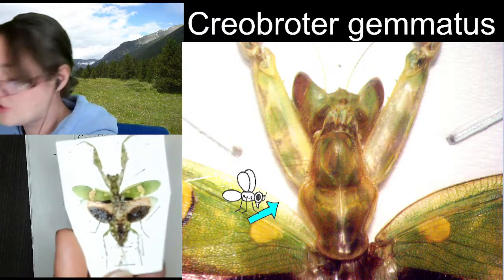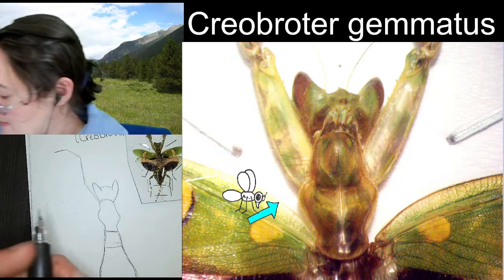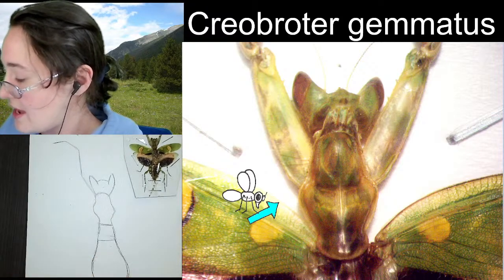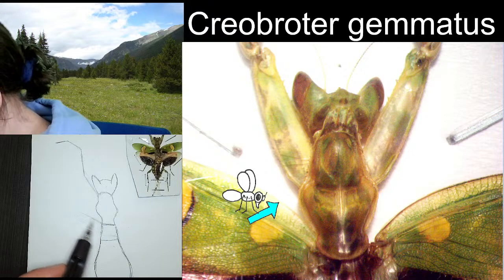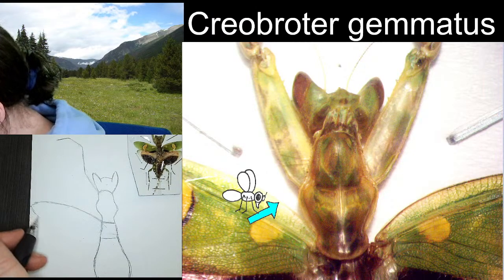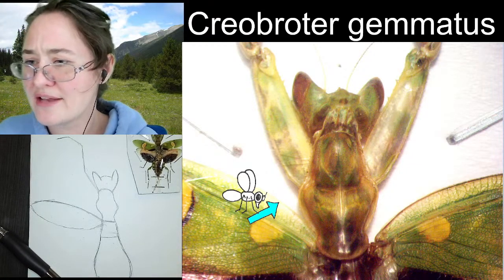So, let's see. I'm going to say this front wing here is about the length of the abdomen. And when I find the ruler, because I'm sure I will by the end of the live stream, I'll make sure to give you an actual number. But if I take the length of where our abdomen was, and then we put it out this way, that's what I'm thinking. Our wing is just going to go all the way to the edge of the paper. I think I've got the spacing on this specimen just about right. So there is a little bit of a point at the end of the forewing, and then it comes back down. Now, because praying mantids are an orthopteroid, I'm going to go ahead and spell that for you.